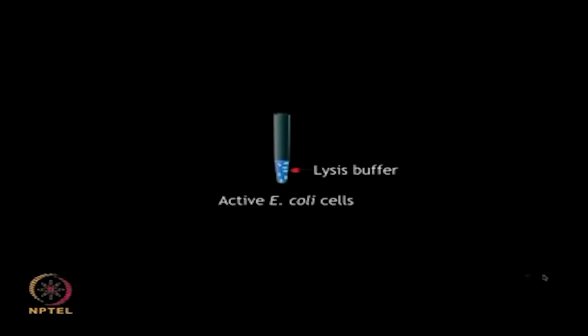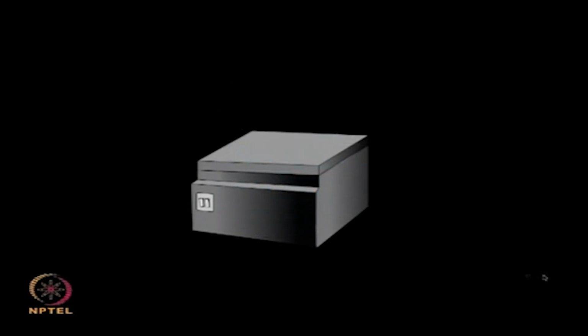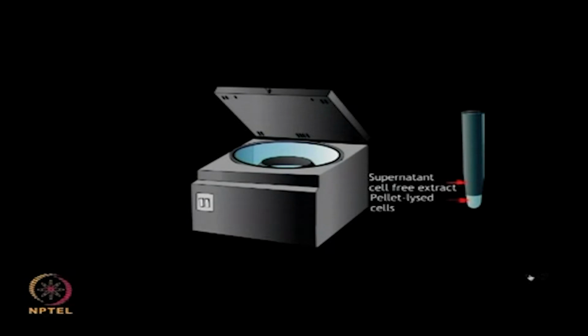The cells are lysed in a suitable buffer, and after that they are centrifuged at 30,000 G to collect the supernatant containing the extract. Now, this lysate, which is present in the supernatant after the centrifugation step, contains the cell free extract.